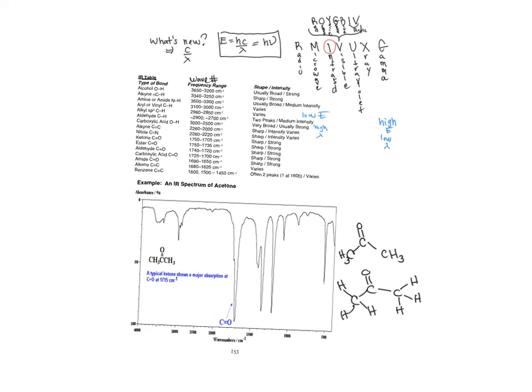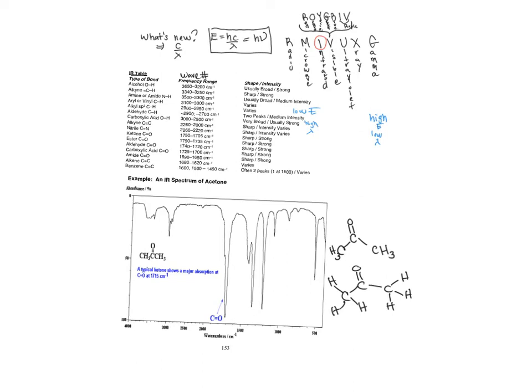So now, how do I use this information that I know I have acetone, and I've taken an IR spectrum? What about the IR tells me that, or confirms that it's really acetone? This is a big deal here. The carbonyl stretch is going to be one of the 2 or 3 you're always looking for. You'll pretty much memorize where those are in acetone. Look how strong it is. It takes up the whole length of the spectrum.